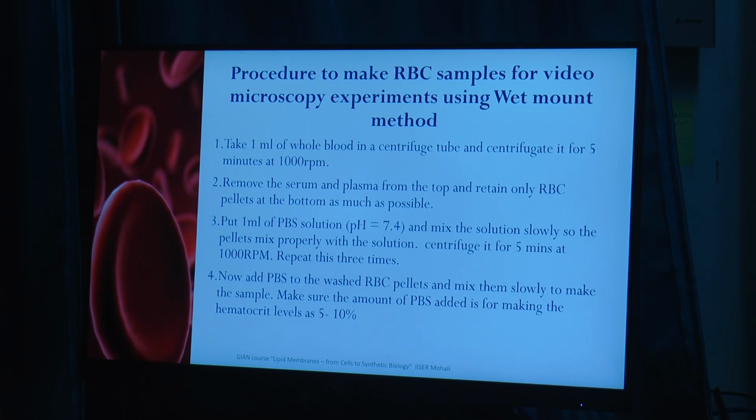Red blood cells are 45% of whole blood, which means if you have 100% whole blood, only 45% of it is red blood cells. The remaining is the white blood cells and all the other constituents I was talking about. Now if you want only the red blood cells, we have to follow this protocol and remove the rest of them.